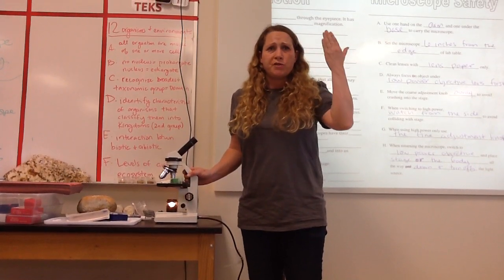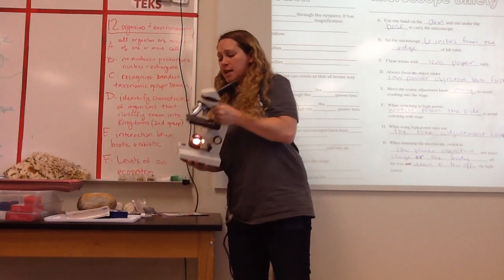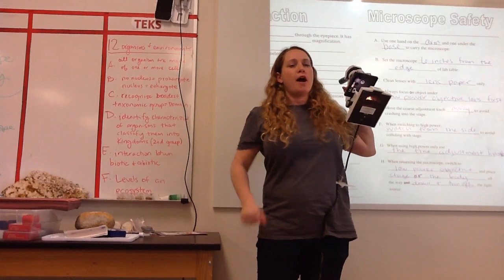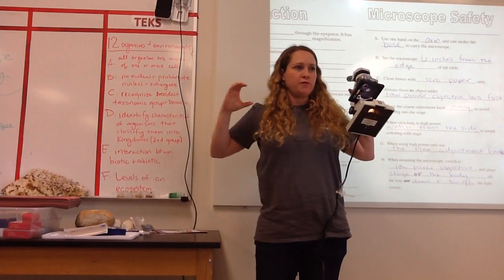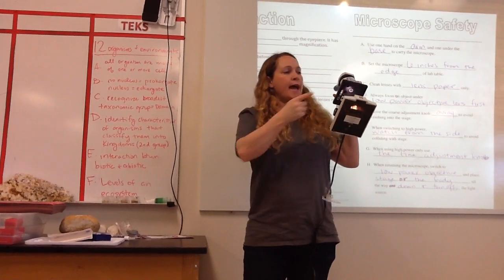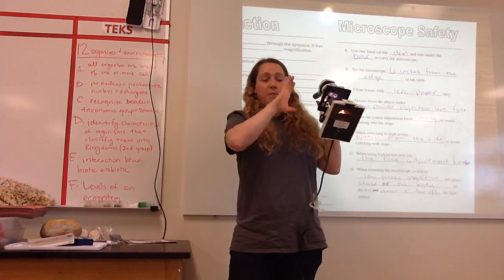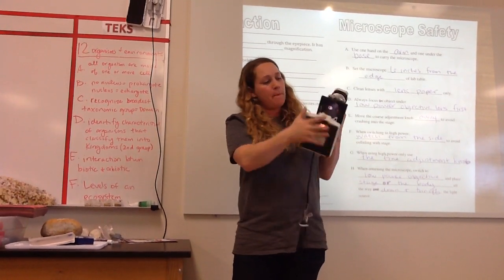So in my mind, I'm like, what's wrong? Okay, in order to show you, I'm going to remove the slide. So there's this thing under the stage. It looks like a big disc. In fact, it looks just like a hand pencil sharpener, how you can turn it, and there's all the different size holes for the right pencil. Does that make sense? It has exactly the same thing, but it's not for a pencil. It's for light. Too much light, and the picture's too bright. Not enough light, and the picture's too dim. So you need that perfect amount of light.